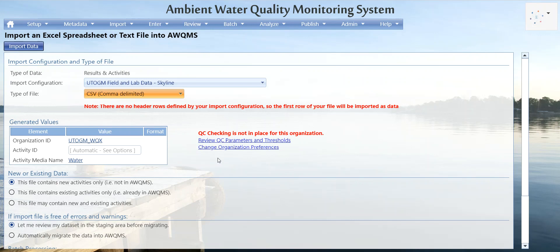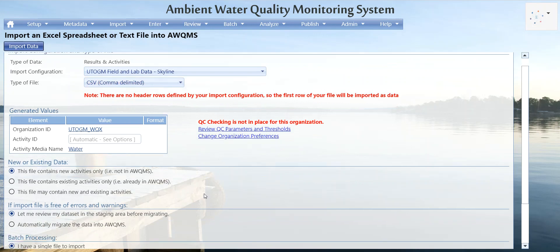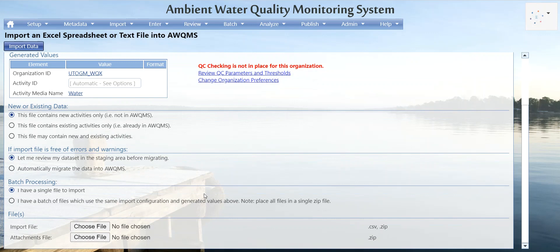You can jump to review QC parameters and thresholds or change organization preferences. Here you have the option to choose what type of data you're importing: are they new activities not in Aquums, existing activities already in Aquums, or does this file contain both new and existing activities? Generally you keep the default, which is importing new activities only.